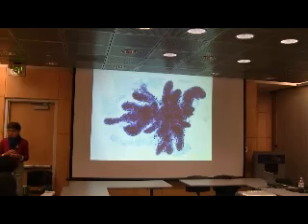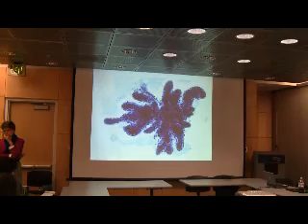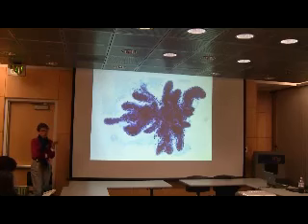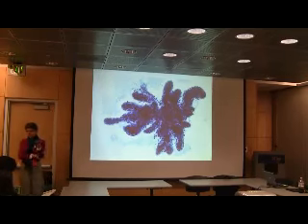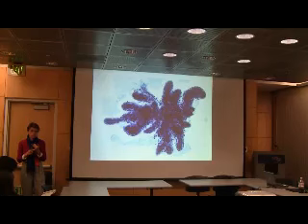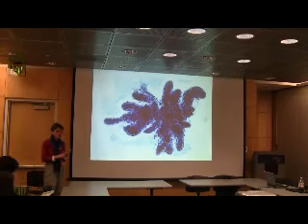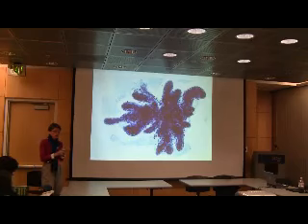Can you speak at all about, like you mentioned, when you get tissue from surgeries, you embed it in FFPE. How about for frozen sections of tissue? Frozen section, if somebody is in the operating room and they want to know about the tissue while the surgery is still going on. That would be most often when somebody has a sentinel lymph node done and they want to know if there's tumor in the sentinel lymph node, and sometimes from the breast itself. It takes too long to process it through formalin into a paraffin embedded situation. That would be the next day, and clearly we can't wait for that.